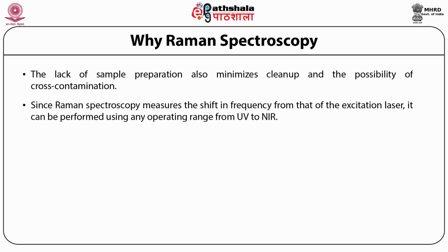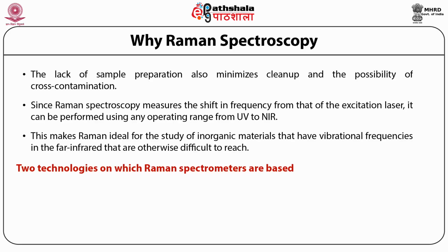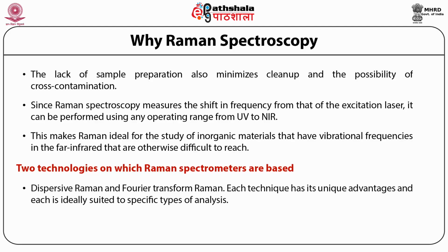It thus permits access to vibrational mode information normally associated with the wavelength ranging from 2 to 200 micrometer. This makes Raman ideal for the study of inorganic materials that have vibrational frequency in the far IR that are otherwise difficult to reach. Two techniques on which Raman spectrometers are based: Dispersive Raman and Fourier transform Raman.